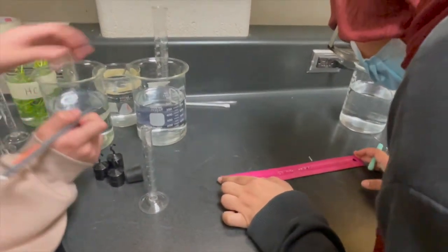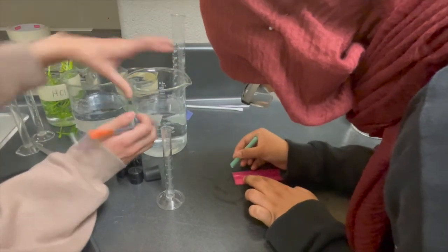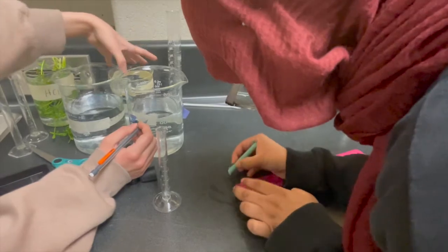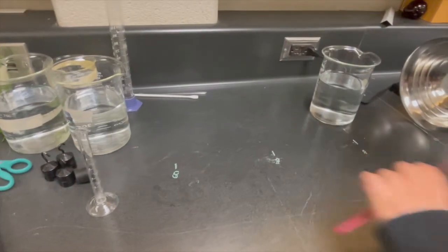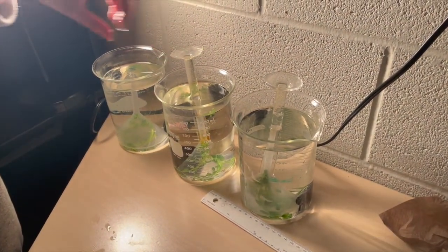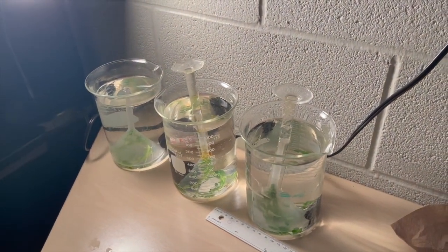We positioned the 3 separate beakers at their designated distances from the lamp, with the first one being 20 centimeters away from the lamp, the second one 40 centimeters away, and the third one 60 centimeters away. And we made sure the lamp was off at this time. Subsequently, we placed 2 trimmed stems in each of the beakers, ensuring that the cut side is facing upwards. We placed a funnel on top of the 2 stems in each beaker.